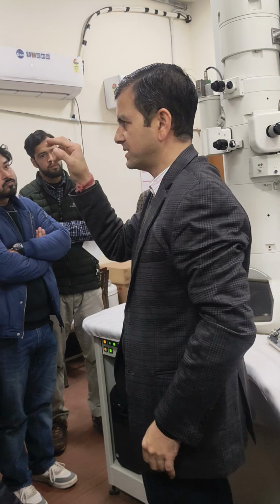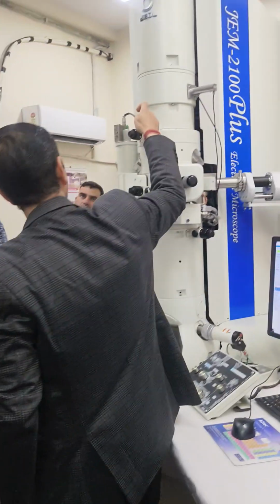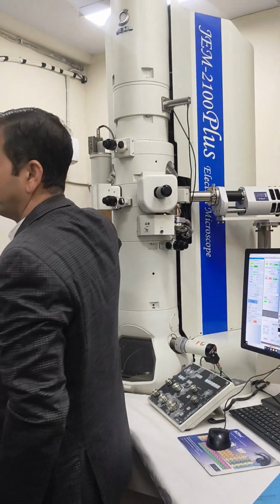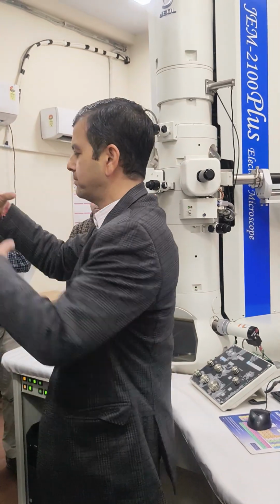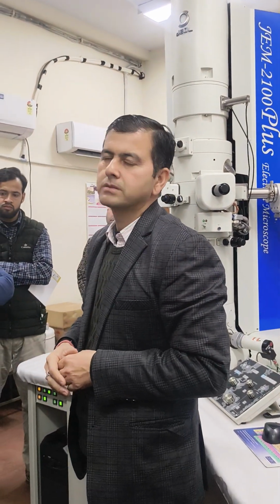You can see we have different aperture diameters. As sir showed in one presentation, 10 micrometer diameter, something like that. So there are different diameters, suppose 20 micrometer, 10, 5, 2. The smaller the diameter, the smaller the beam we can generate. The beam coming like this becomes smaller. But it is more for contrast.